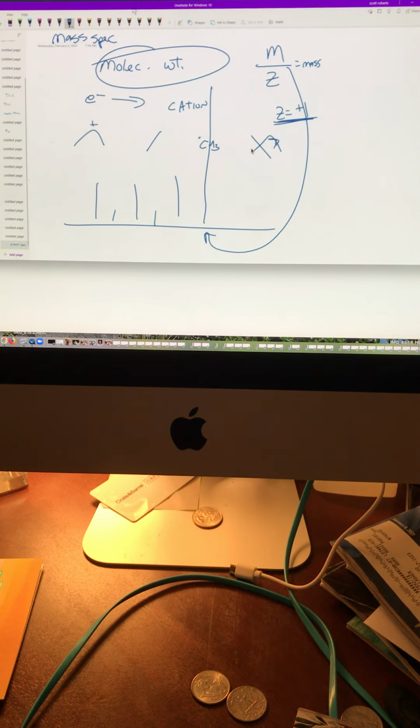So there's something called the base peak, and that's not the molecular weight by any stretch. Zero could be left or right, so I'll put zero over here. This is really, really easy. Listen, this is called the base peak, and the base peak is your most stable carbocation. In this case, it'd probably be this one. The base peak is the most stable fragment, and the most abundant.